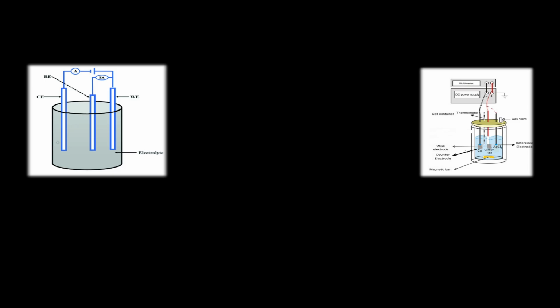The cheapest reference electrode is a graphite rod. However, there are a number of reference electrodes that can be purchased, such as a silver-silver chloride electrode, a standard hydrogen electrode, and a calomel electrode. Now, these electrodes have fixed voltage potentials. A graphite rod may be used as a reference electrode.